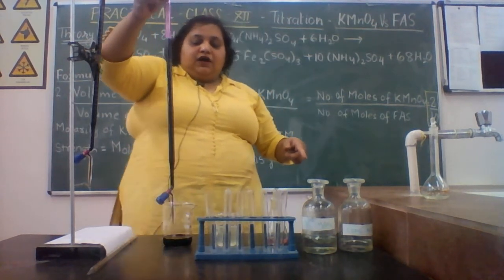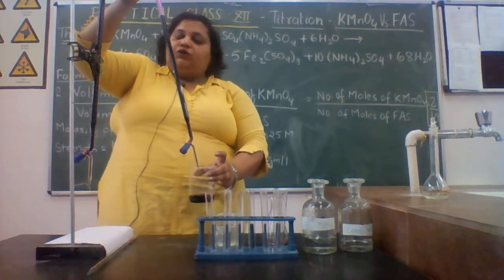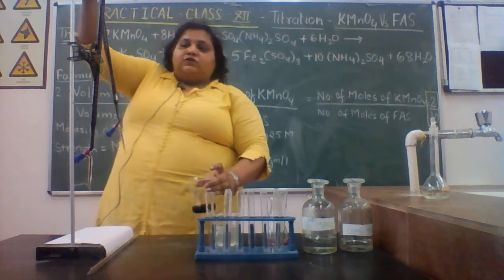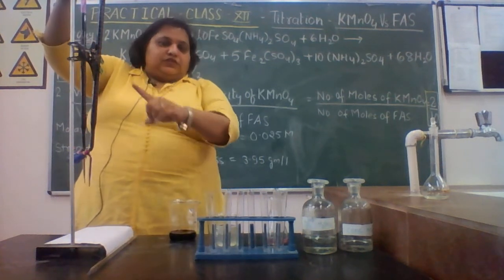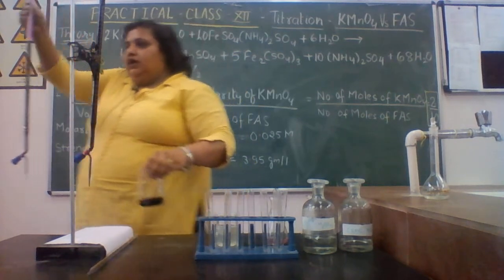Even during exams I have seen some students place the funnel there. This is the mistake you do not have to make. You just have to fix it in the burette stand properly vertical, so that you can see easily.